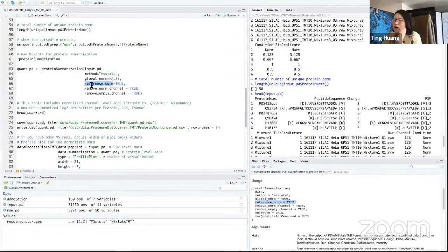Again, for the normalization channel, we also had two or three questions about how we prepare the reference channels. What I know, because we don't run a wet lab but from our collaborators and also papers, in most of the data sets I saw, the reference channel is also called the master pool channel. It usually uses a pool of samples, a small proportion from each sample in the study.